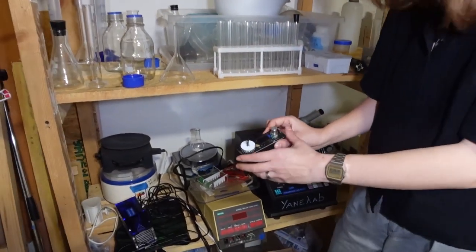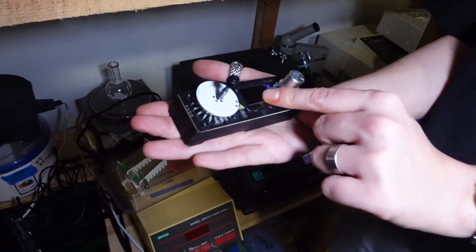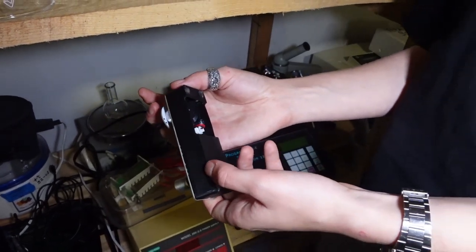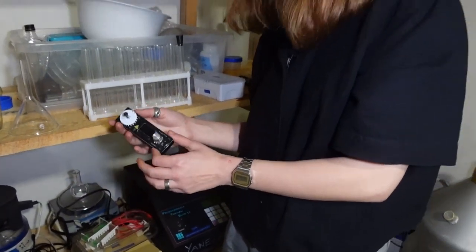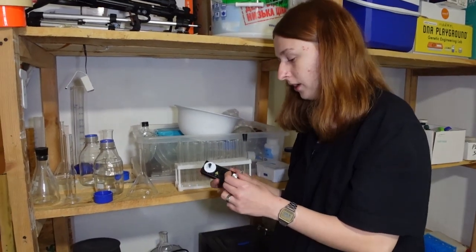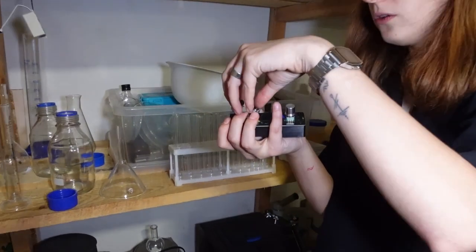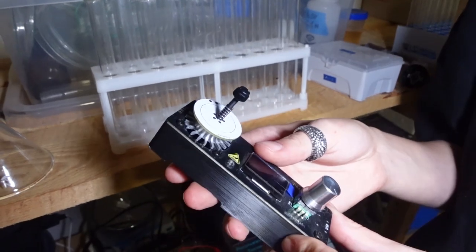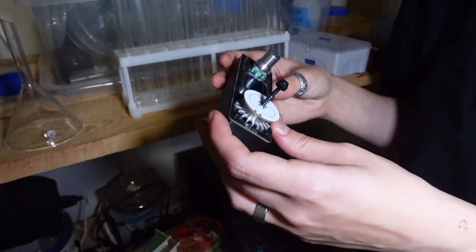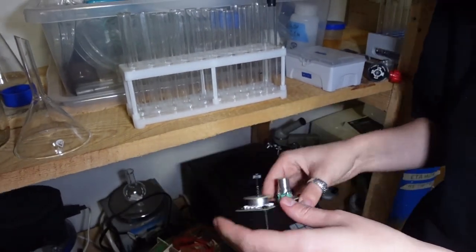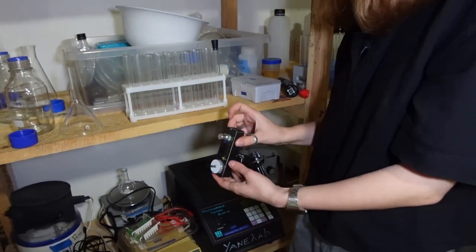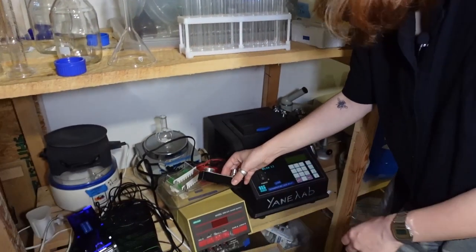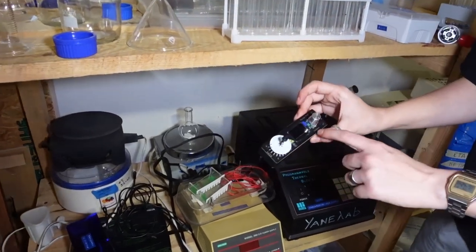I have this amazing PCR machine, it's super tiny, it's the smallest PCR machine out there. It's super affordable, like 120-150 dollars, super easy to use. It doesn't have a heating block on top so you have to use mineral oil, but our ancestors did PCR with pots and stoves. You just use USB type C, super easy to program, super easy to run. It's 3D printed open source, it's from Gaudi Labs Pocket PCR.